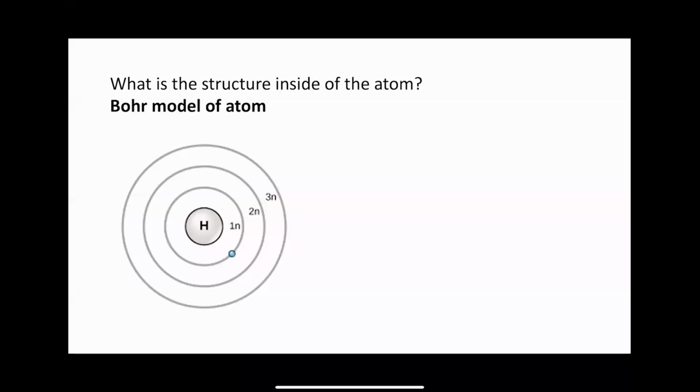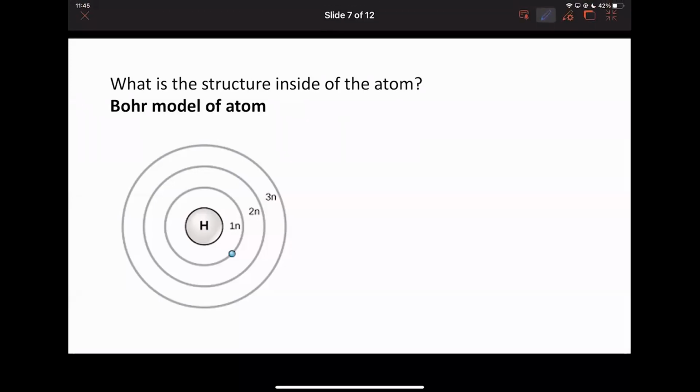I've cleared what I had written earlier. This is the slide I looked at, but now we have a little picture of what's going on. When you have a flame test, you're basically taking an element and adding energy to the atom. Adding energy to the atom does not go to the whole atom, it doesn't go to the nucleus. What it does is add energy to an electron. Specifically, adding energy to this hydrogen atom adds energy to this electron, which is in the ground state, in energy level 1.